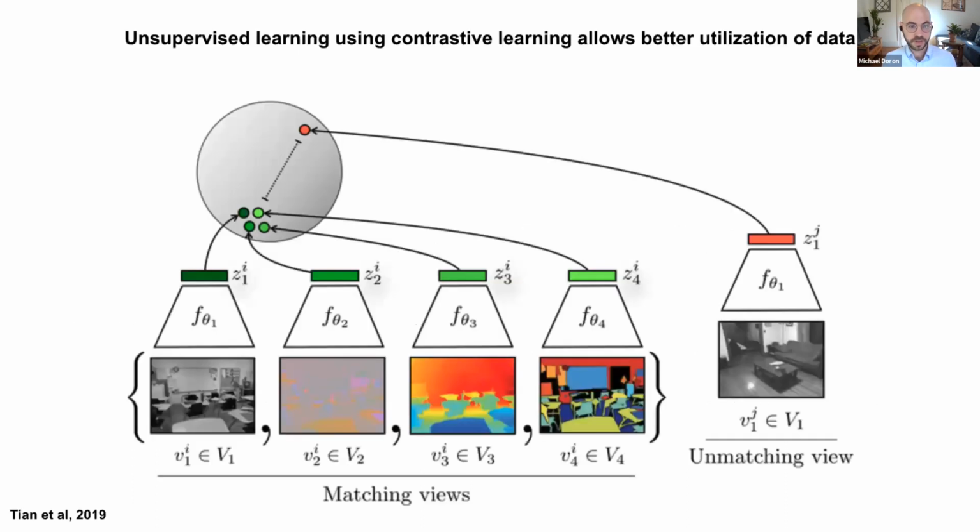In this specific project, we're working with a version of unsupervised learning called self-supervised learning, in this case something similar to contrastive learning. If the upper left corner is the feature space, the model takes these two samples, or images in this case, and creates many different versions of them, many different augmentations or views, if you will.